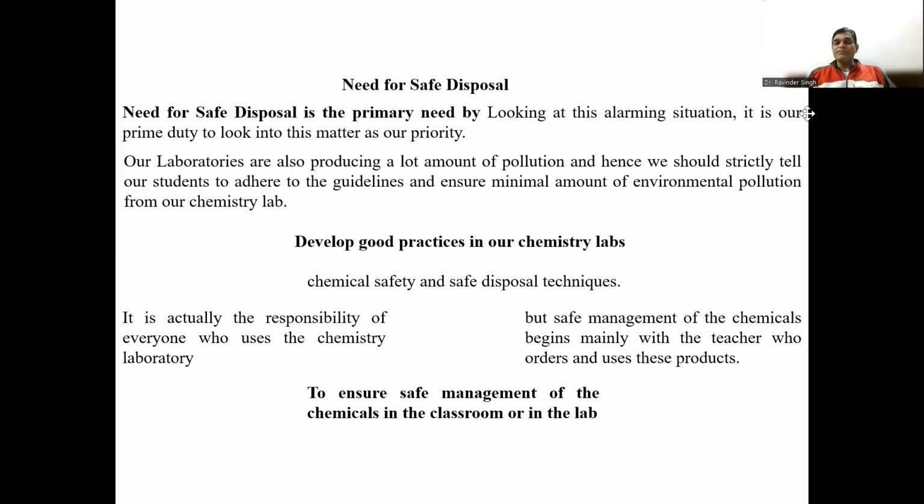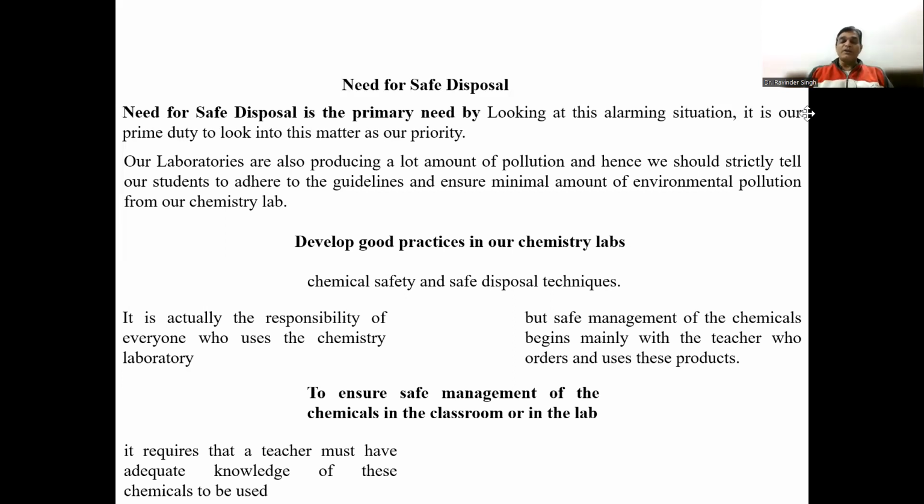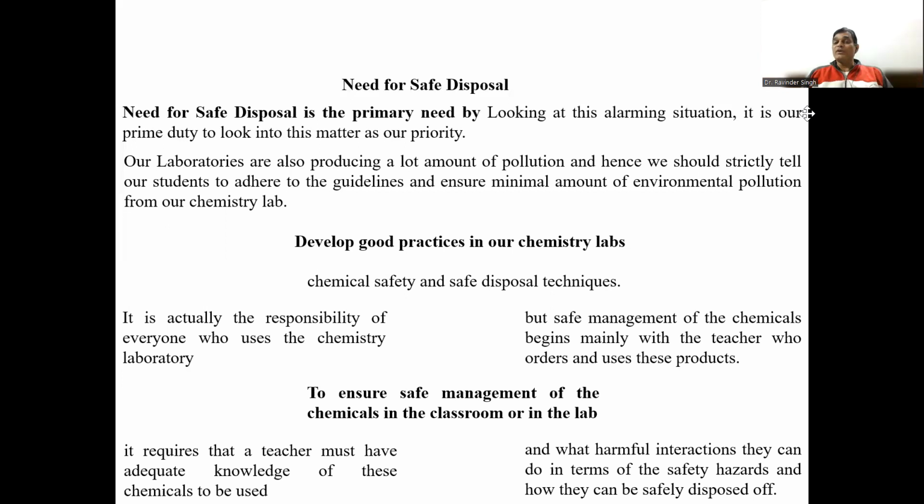So to ensure the safe management of the chemicals in the classroom or in the laboratory, a teacher must have adequate knowledge of all these chemicals to be used, what harmful interactions they can have in terms of safety hazards, and how they can be safely disposed of.